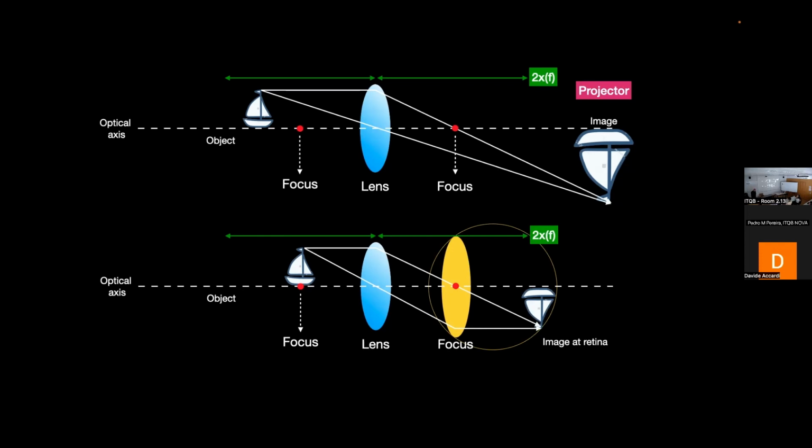If you observe something small and you put a screen after the lens, you will not see the image, you will only see white. But if you put your eye, then your eye has a lens that converges the rays, so it will create a real image on your retina, and that's why you see it, okay? But the magnifying glass itself will only send the light to infinity. So the information is there, but the image is not real. That's why you say the image is at infinity. Okay. And this is what happens with magnifying glasses.